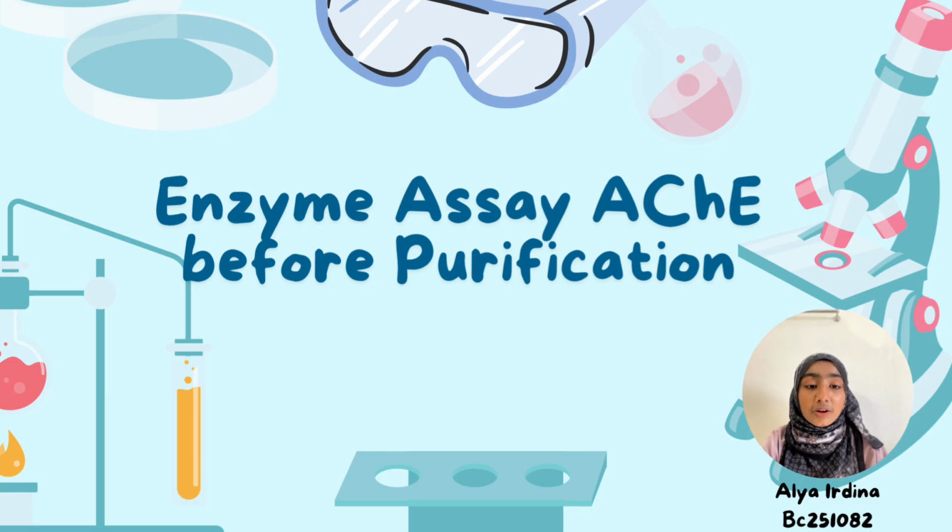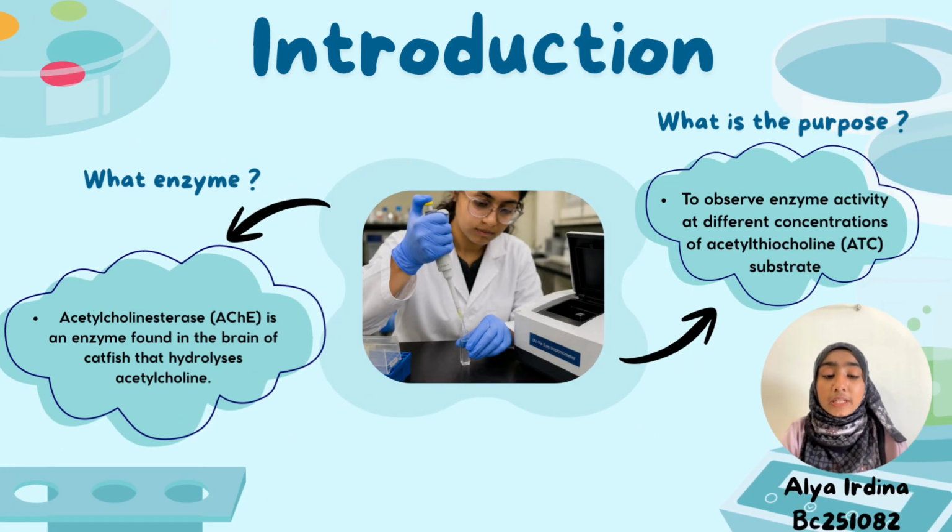In this video, we will show you what an enzyme assay is and how we conduct an acetylcholinesterase enzyme assay before purification in the lab session. Before we go further into the process, let me give an introduction.